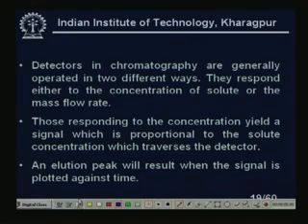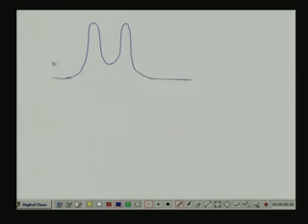So, there can be different components. How does it look? Let us look. You see here the selectivity and efficiency, this is very important in the case of the peak, right. Those are the things we should discuss. What is the selectivity, what is the efficiency? Let us look. You see here, these are injections I have made here. This is adequate selectivity, but poor efficiency.